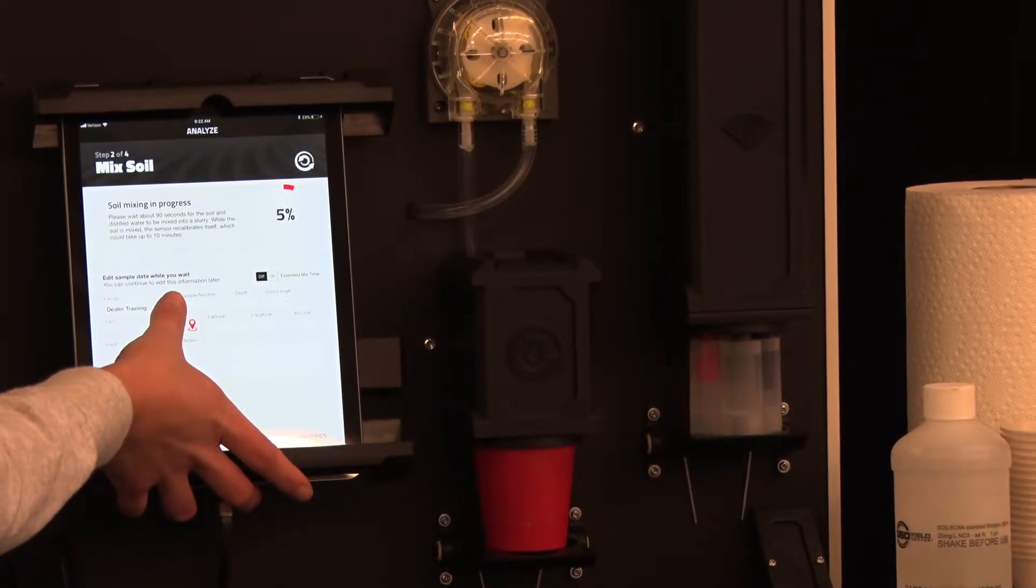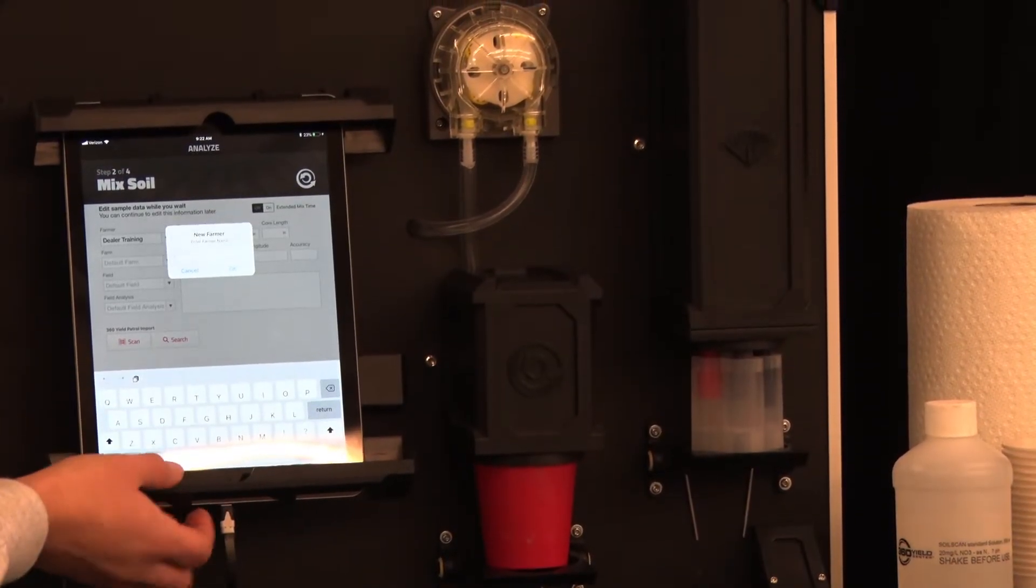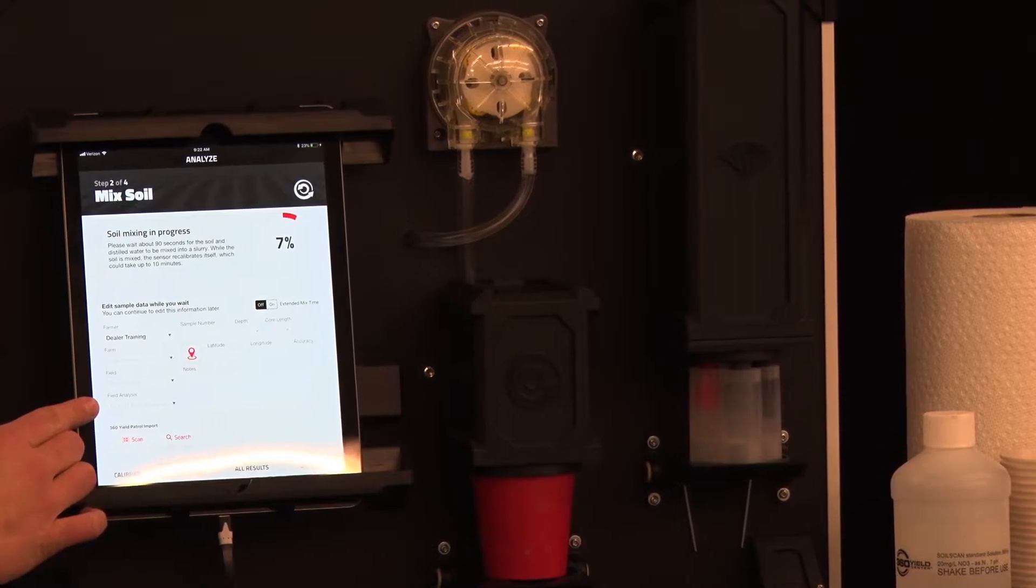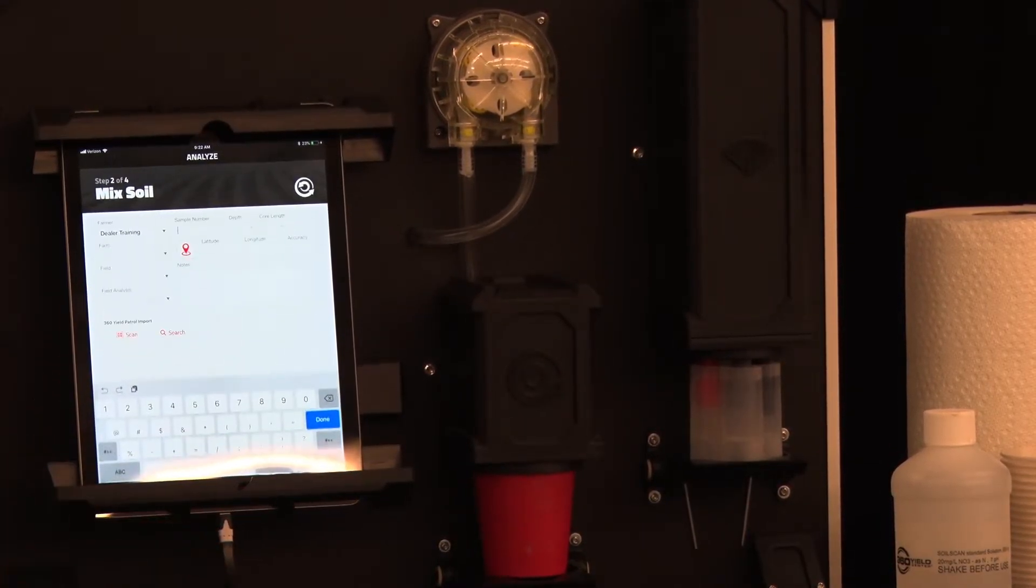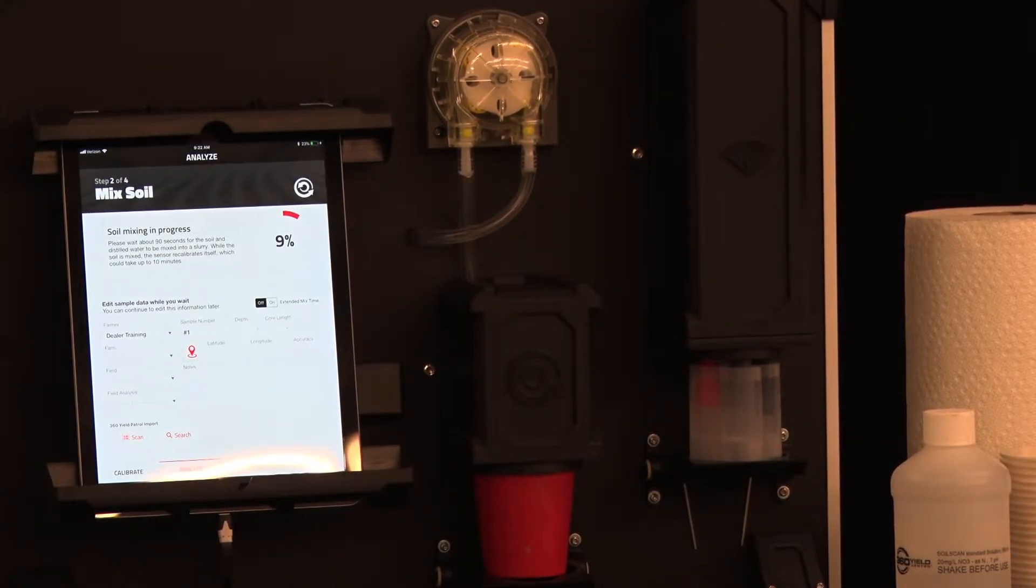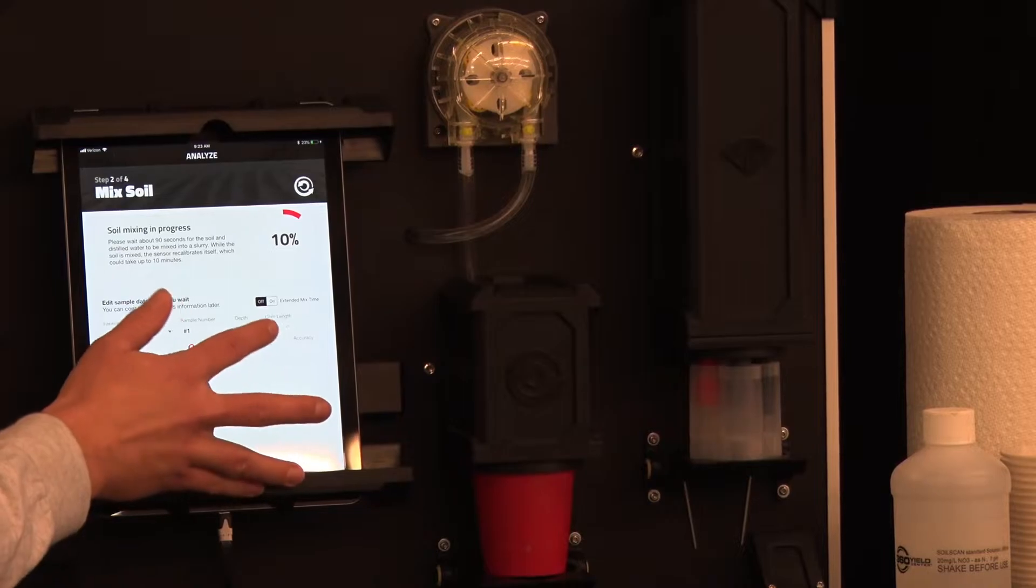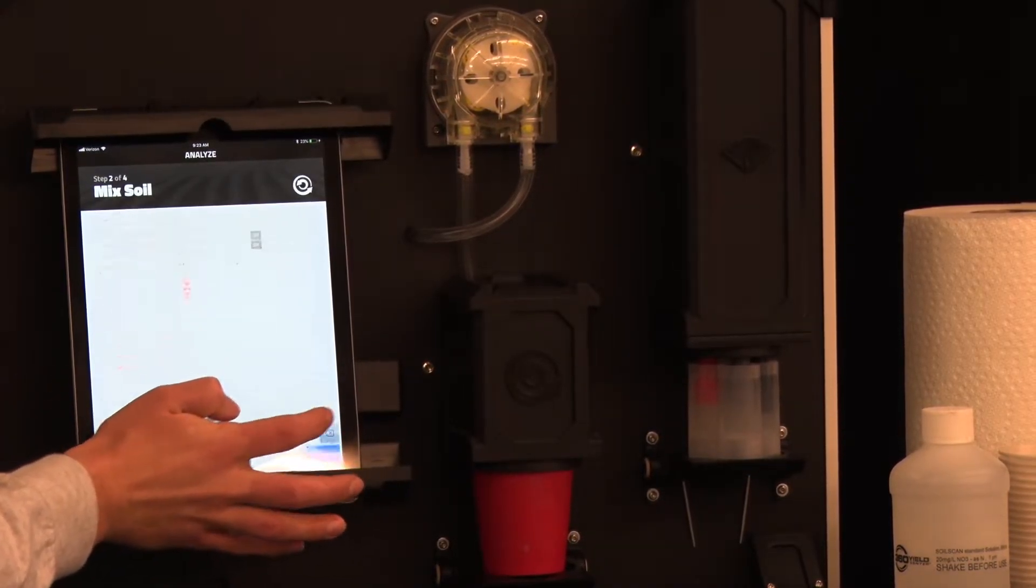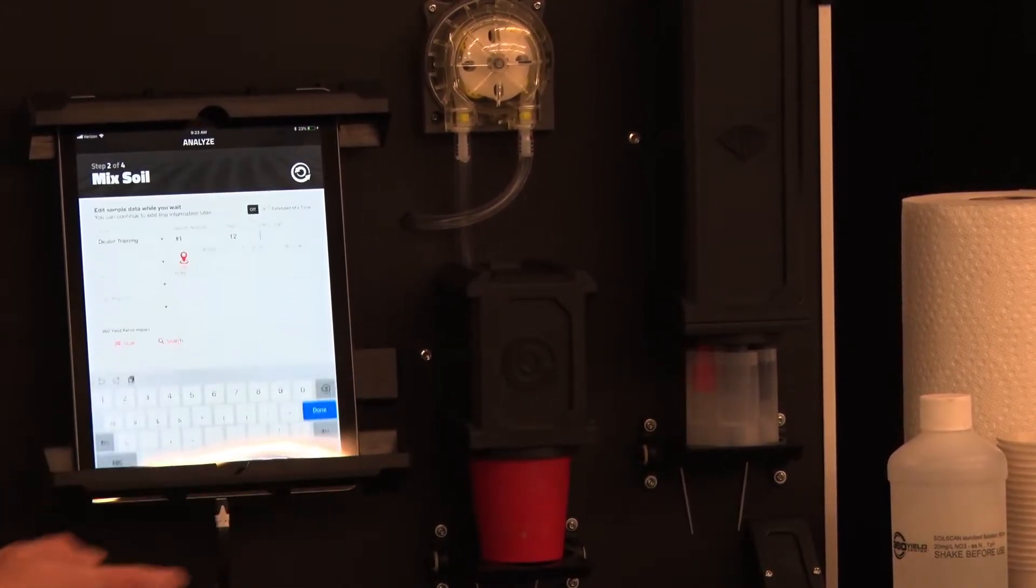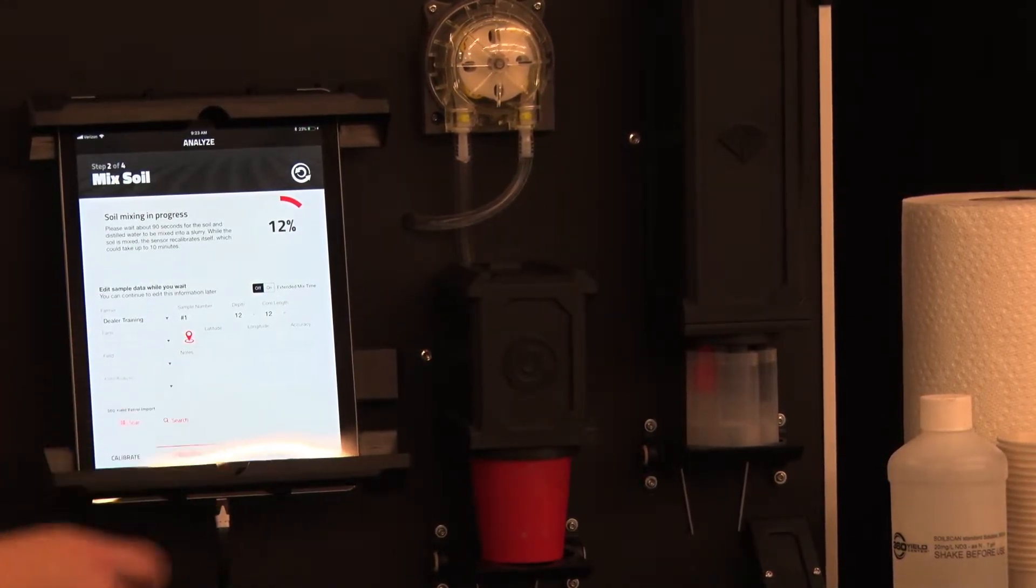On the left side of the screen you can select your farmer, select add and type in the name. You can select a farm, a field, and field analysis. You'll also want to give your sample a number. The depth is the depth of the sample that you took. If you probe 12 inches deep then you would put 12 here. The core length is going to be how much of that that you used. So in this case we'll say that we used all 12 inches of that sample. You can also enter any notes that you have.